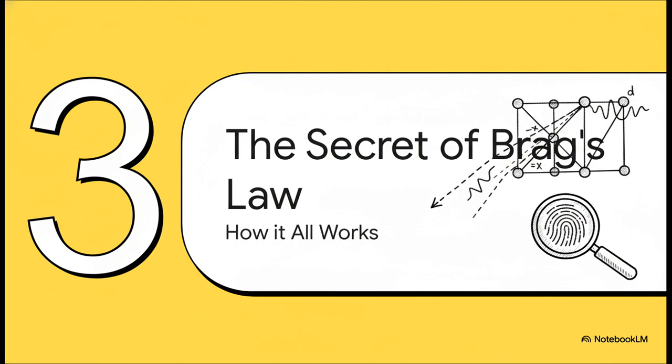Okay, this all sounds pretty cool, right? But how does it actually work? How do you go from just shooting X-rays at something to getting this detailed fingerprint? The answer is in a beautifully simple piece of physics called Bragg's Law.